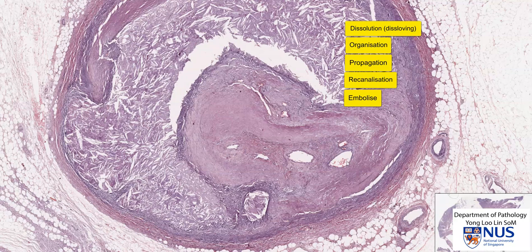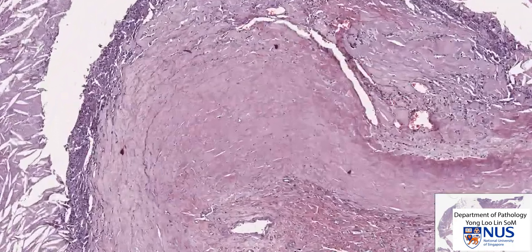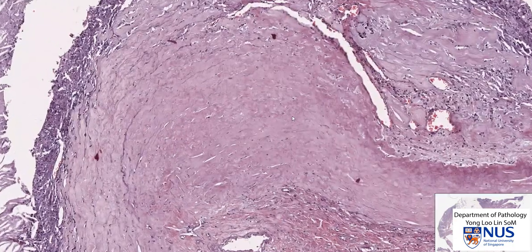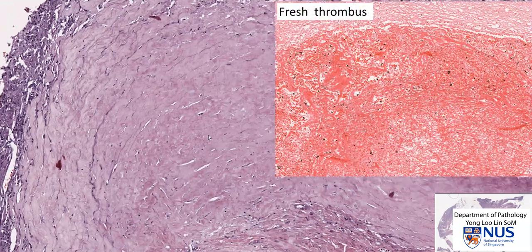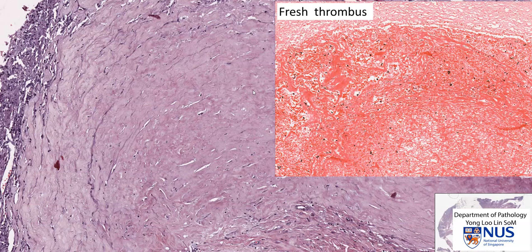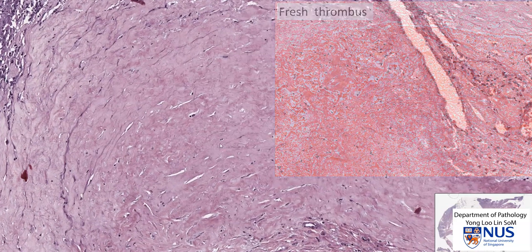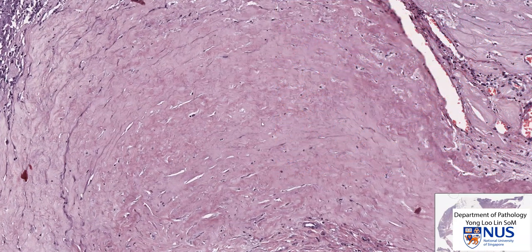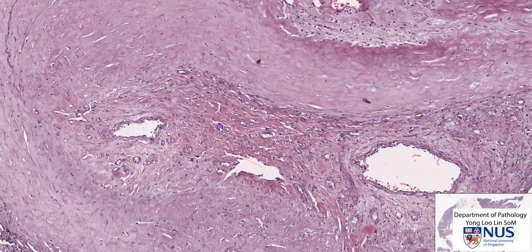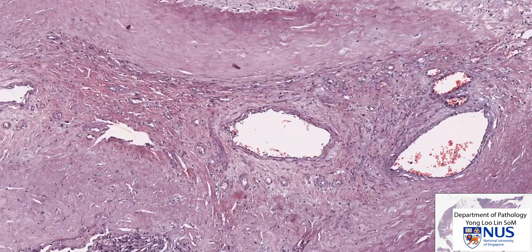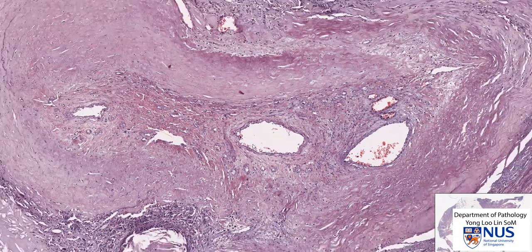Here we are looking at organization — an organized thrombus. How we know it's organized is when we look at higher magnification we don't see the appearance of a fresh thrombus, which is a lot of red blood cells and fibrin strands. Instead, we see this thicker, bundly-looking collagen pinkish material. This is fairly mature collagen, laid down by fibroblasts, and we see in some areas a little attempt at reforming the lumen of this original artery.